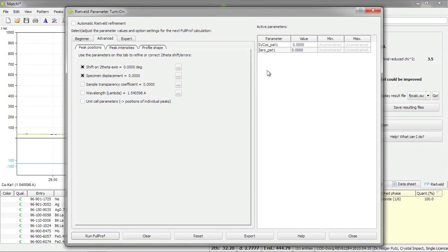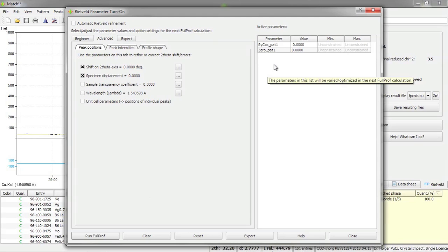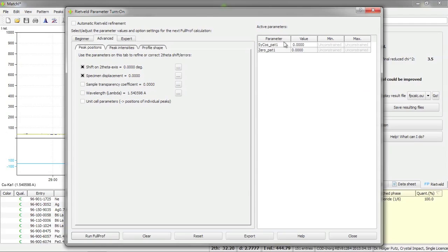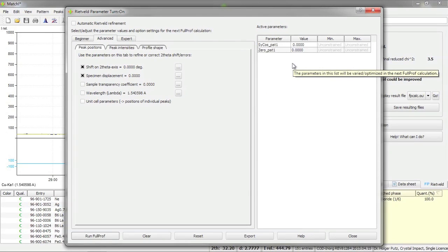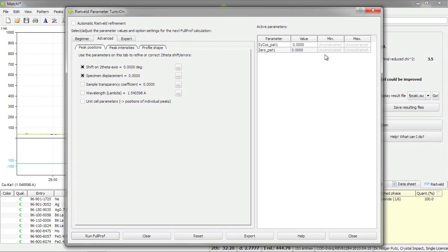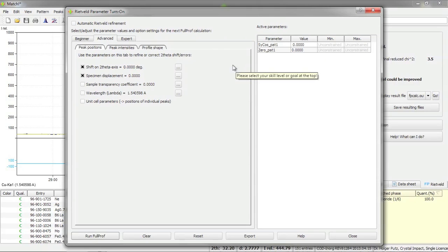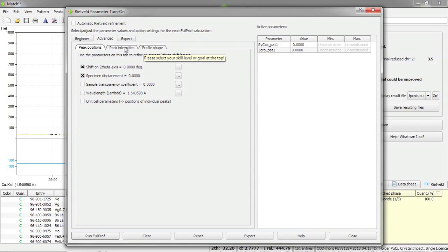Here on the right hand side you may have noticed that both parameters I have activated have been added to this list of active parameters. Here you can get an overview over all parameters that are currently marked for being refined in the next full prof calculation along with the current value and the constraints you may have entered. Let's return back to marking the parameters.